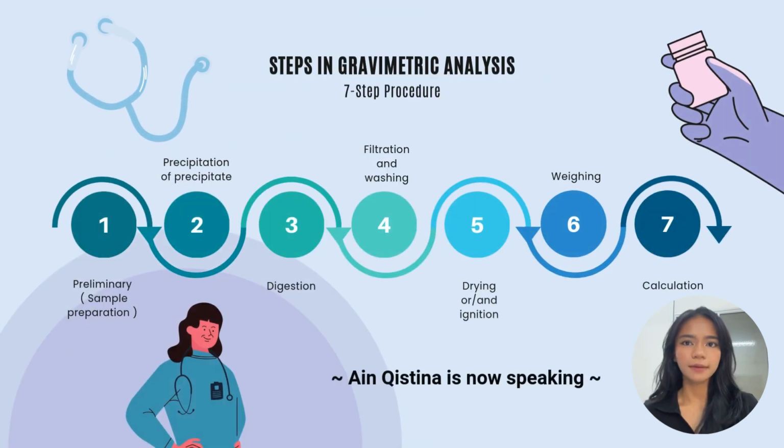There are 7 steps in gravimetric analysis. Firstly, preliminary, also known as sample preparation. Secondly, precipitation of precipitate. Thirdly, digestion. Fourthly, filtration and washing. Fifthly, drying and ignition. Sixthly, weighing. And last but not least, calculation.